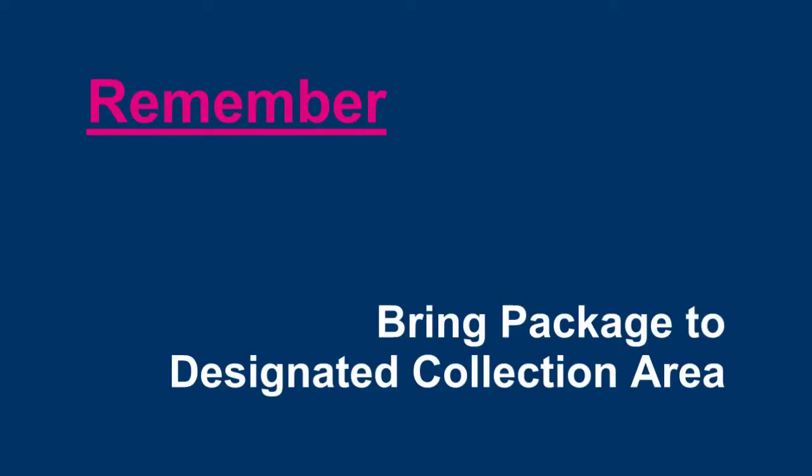The final step is to bring your waste package to the designated area in your building. Please contact your principal investigator or safety committee for access to the designated collection area. Remember, ESF will only pick up from the designated collection area. Please have your waste ready before the date indicated on your chemical waste inventory form.